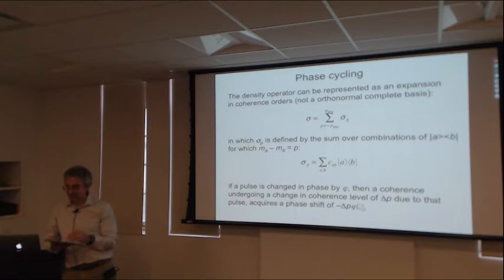And to see it precisely, I would have to resolve the IX magnetization and the IY magnetization into the plus and minus components, and then I would see that the 90-degree shift in phase of the pulse, in that case, would generate a plus pi over 2 or a minus pi over 2 shift in phase of the operators.